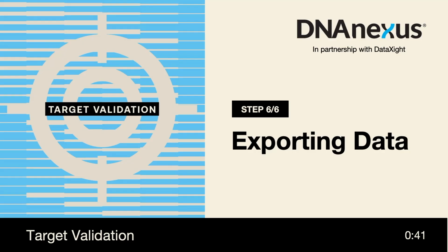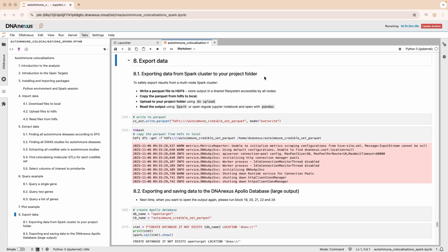In this final step of the series, I'll show you how to export our results from the multi-node Spark cluster. First, we write the output table as a Parquet dataset to HDFS, then copy it down to the local file system so it can be uploaded to the project or opened in a regular notebook.